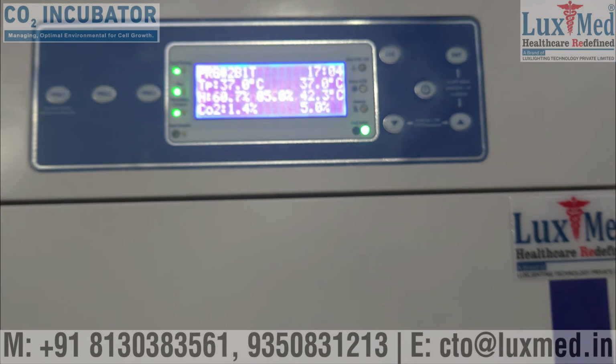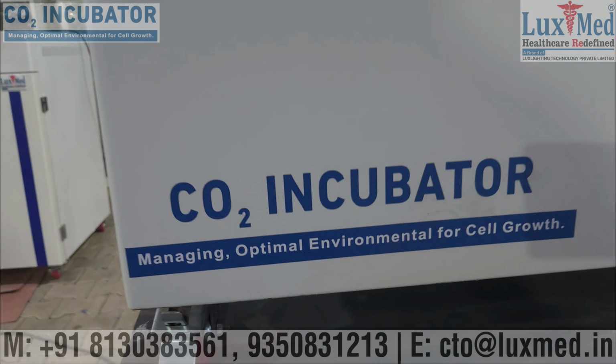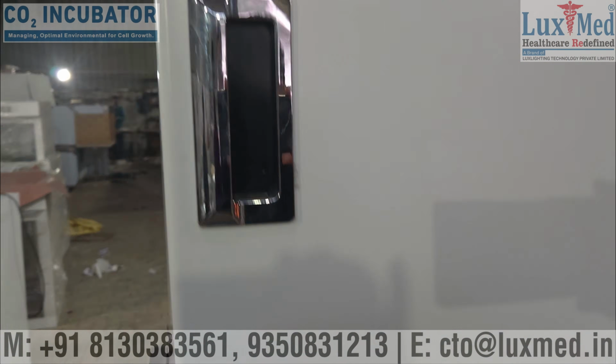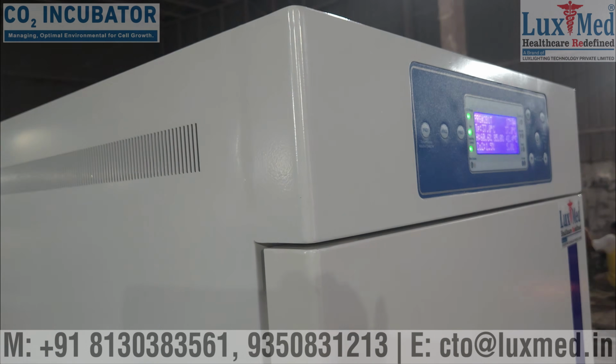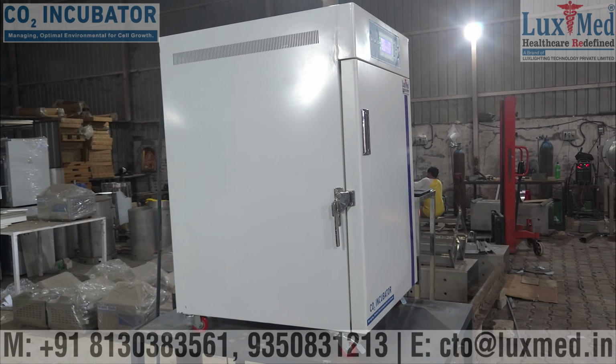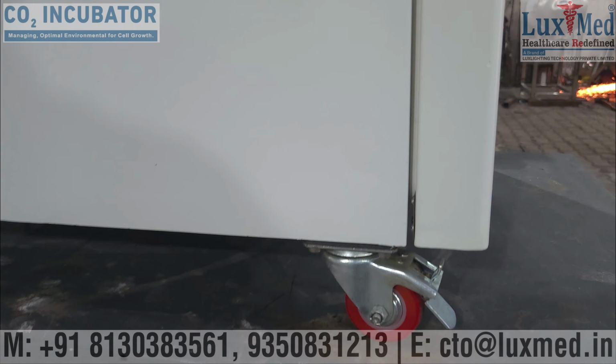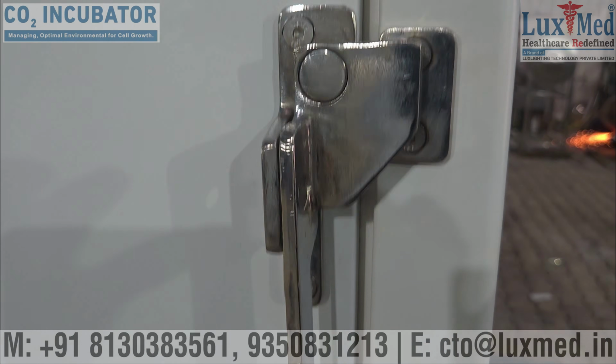Uses of CO₂ incubators. Cell culture. CO₂ incubators provide a stable and sterile environment for growing cells, ensuring optimal conditions for cell growth and differentiation. In vitro fertilization, IVF: they're used to cultivate and maintain embryos during IVF, providing the right environment for embryo development.